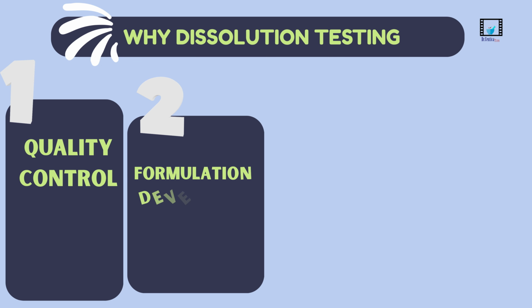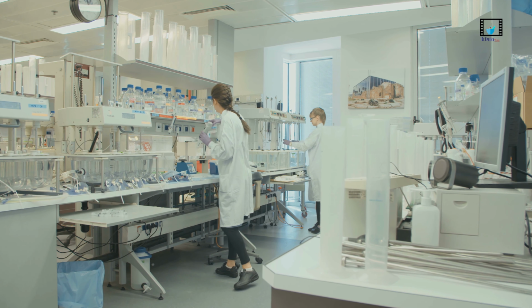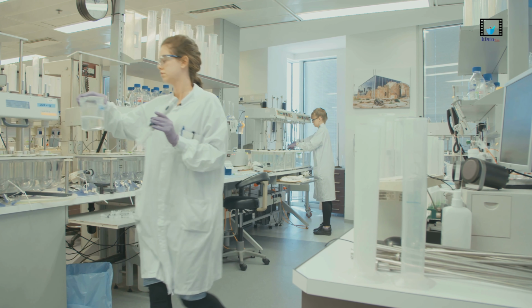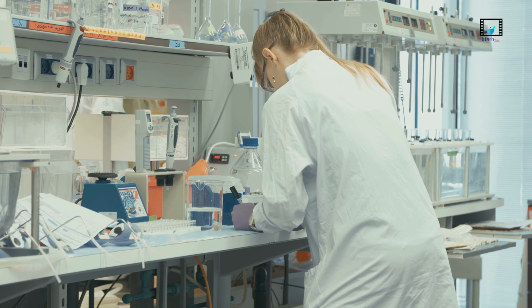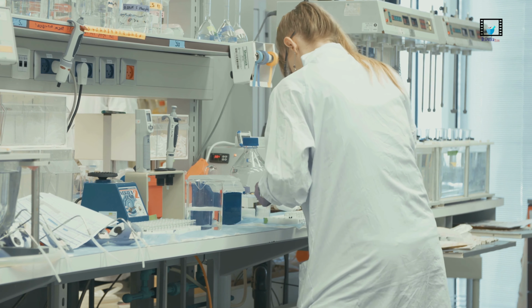Second, during formulation development, we use it to fine-tune prototypes, adjusting excipients, particle size, or coating until the release profile is just right. Third, it's the cornerstone of regulatory bioequivalence, as dissolution can act as an in vitro mirror for what happens in the body, especially for highly soluble, highly permeable drugs.